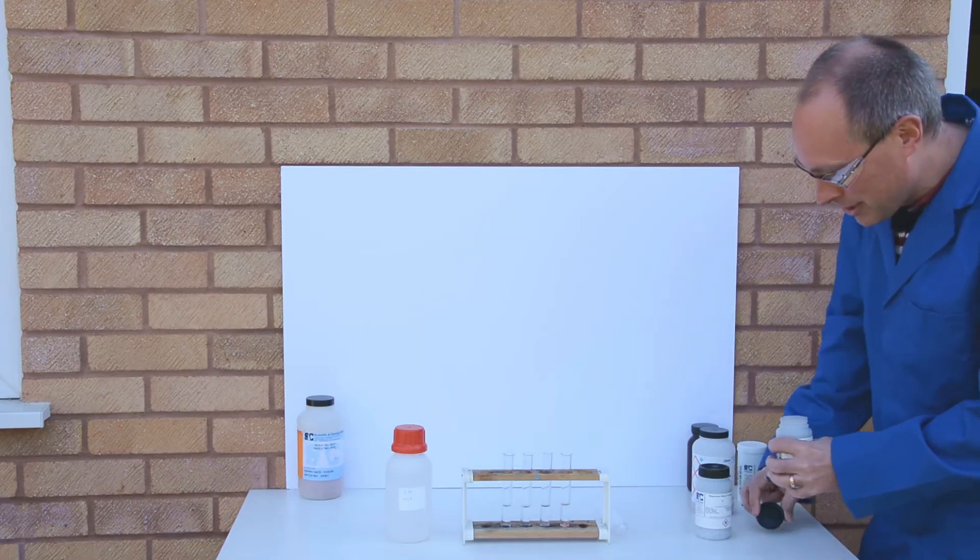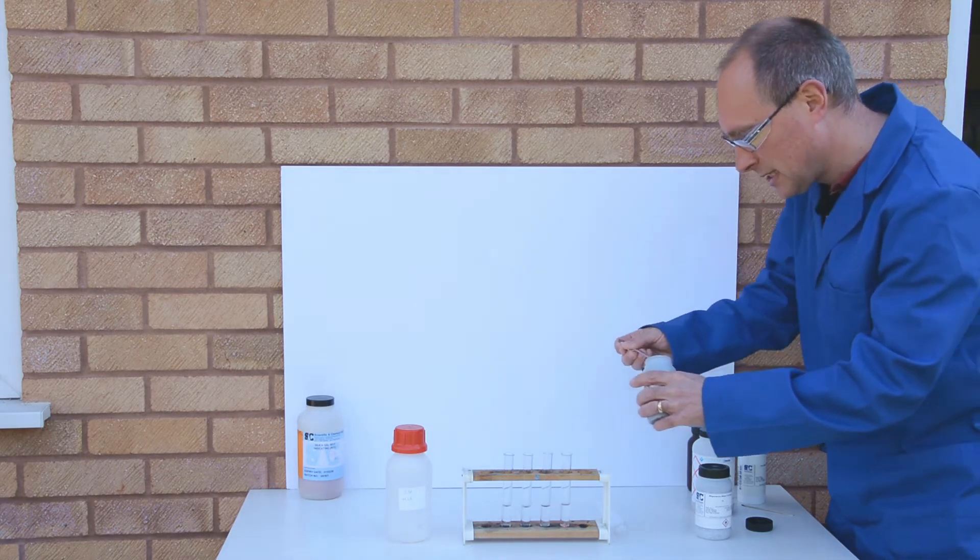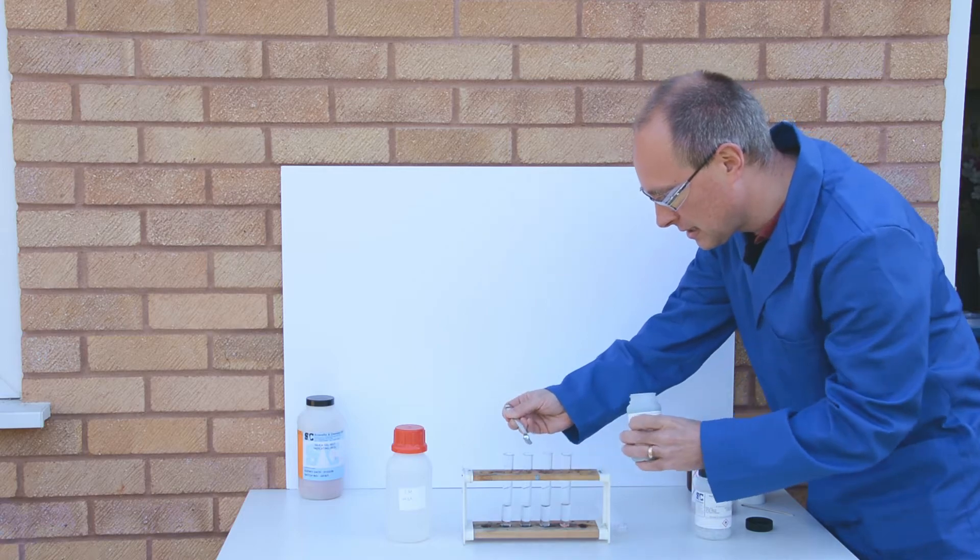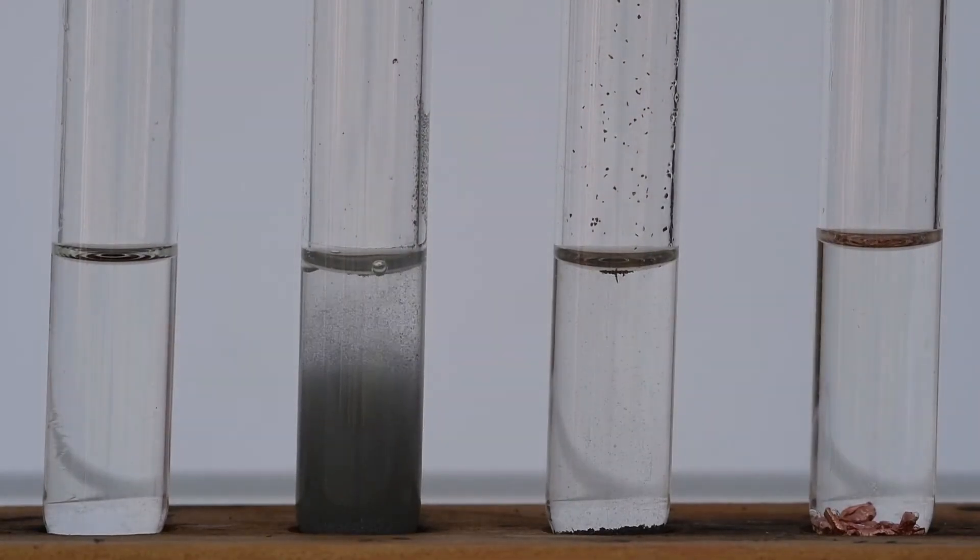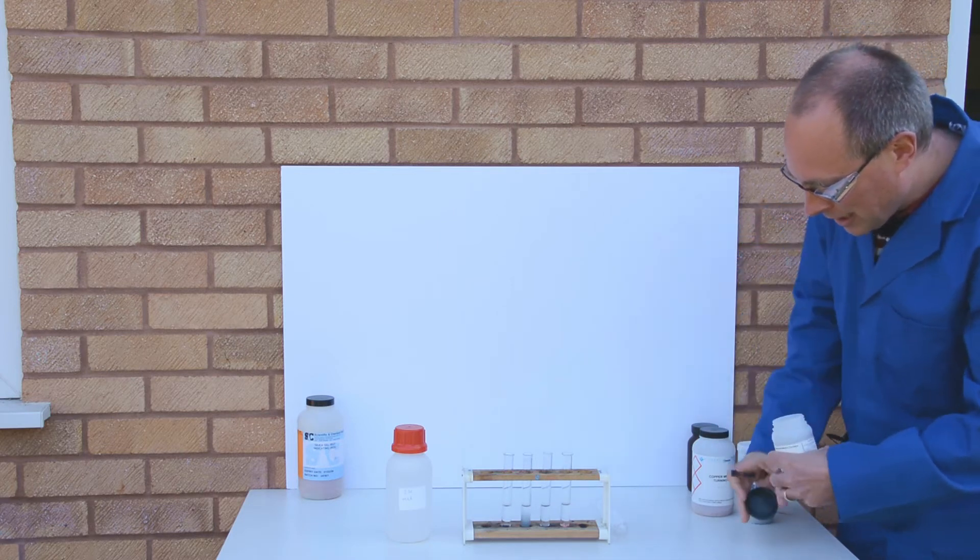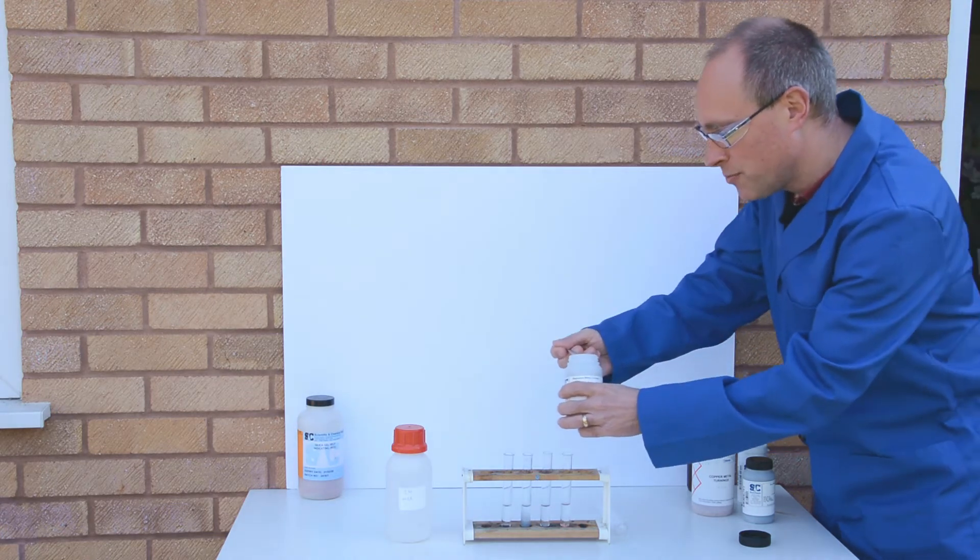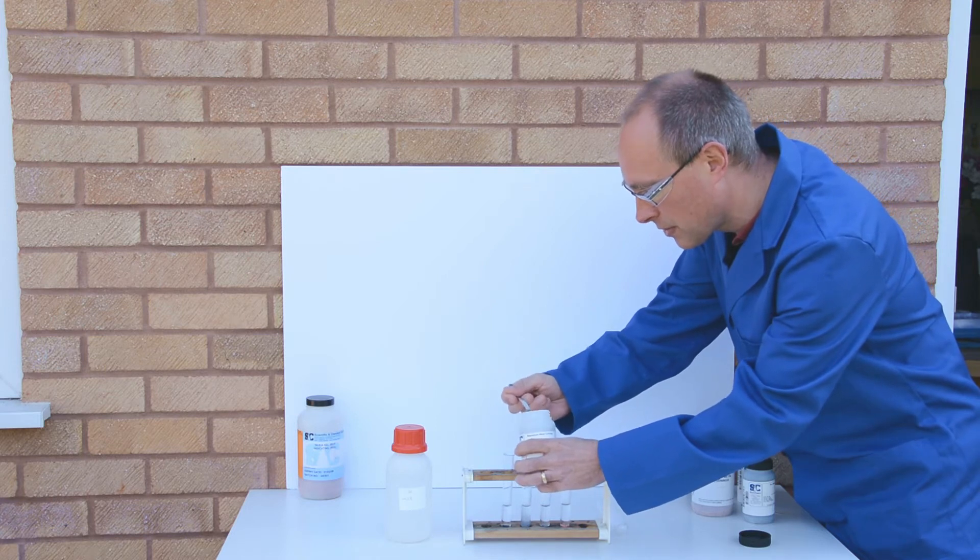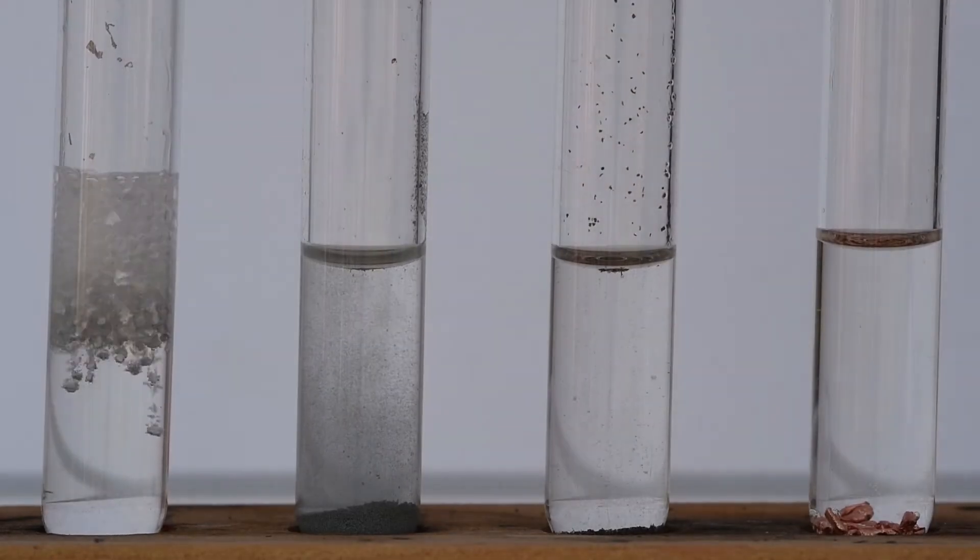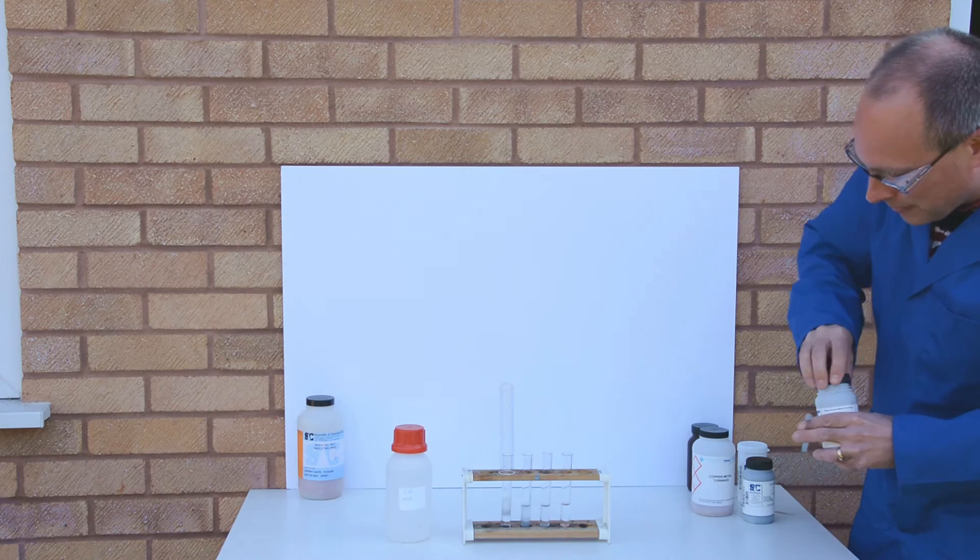In the next test tube I'm going to put a small amount of zinc. Then magnesium - magnesium not as powder but as magnesium turnings. I'm also just going to pop a boiling tube over the top of that to trap the gas that's produced.